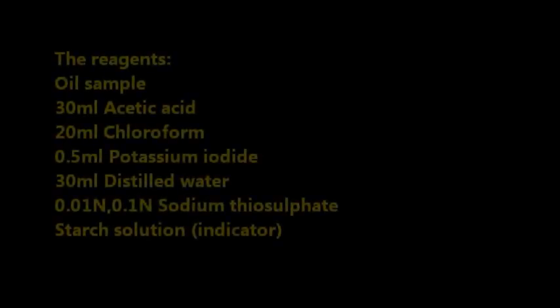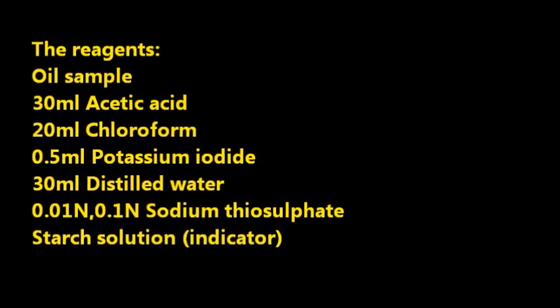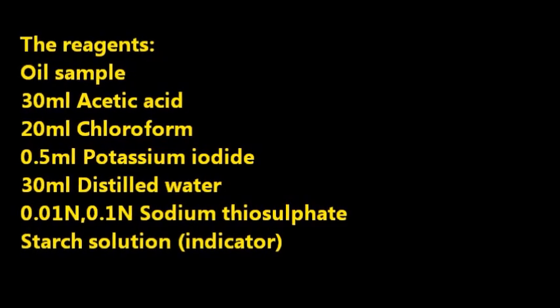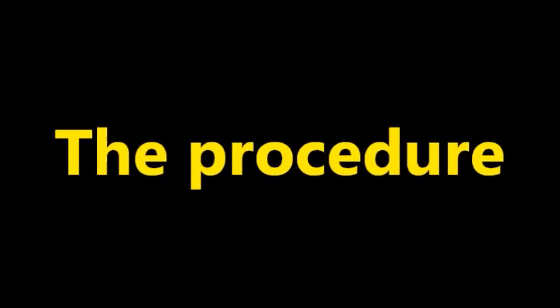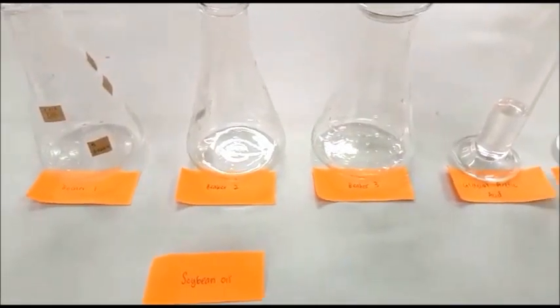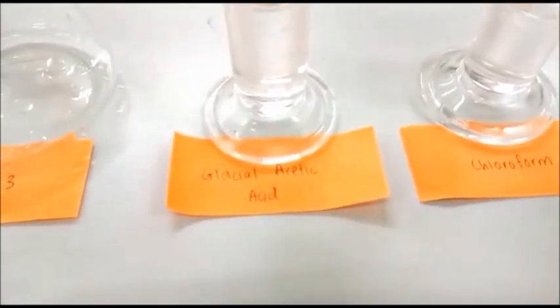The reagents for these experiments are oil sample, acetic acid, chloroform, potassium iodide, distilled water, sodium thiosulfate, and starch. The procedure. These are the apparatus and reagents needed.